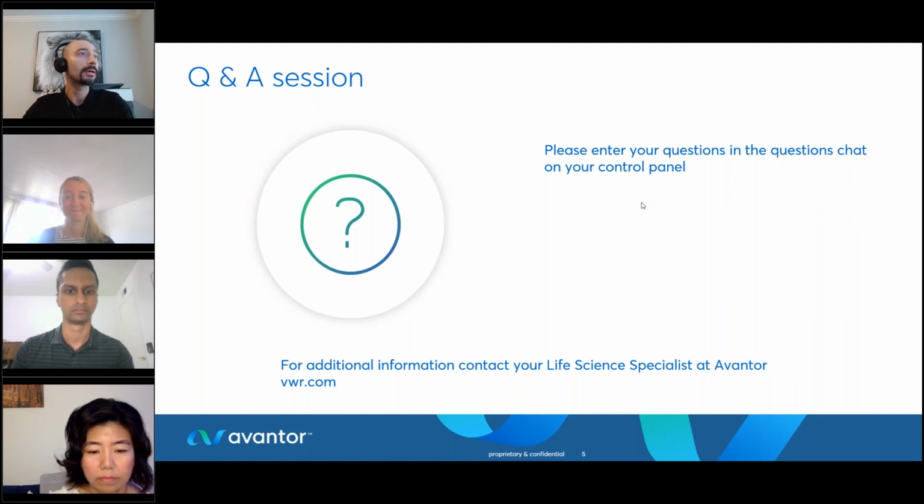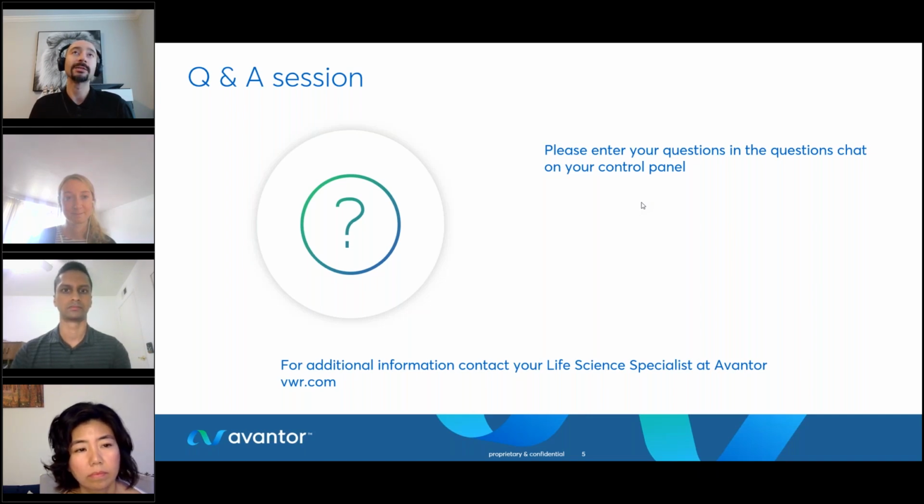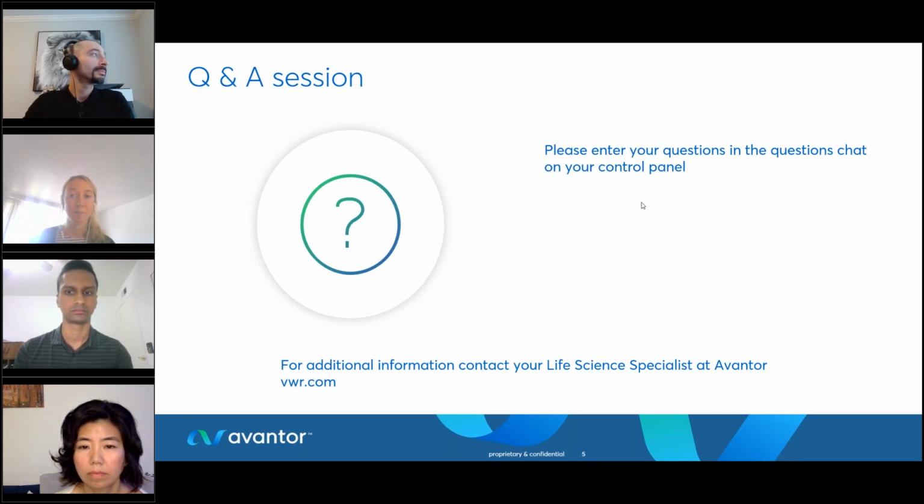So the next question, of great relevance especially to the biopharma and biotech communities: can the Epitome plasmid workflow be run entirely offline? Yes, so you would first need to download and install the workflow either via the Epitome application or to your command line. And then once it's downloaded and installed, you can go offline and the workflow should run fine on your laptop or device.